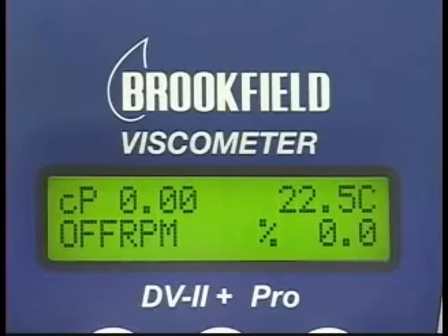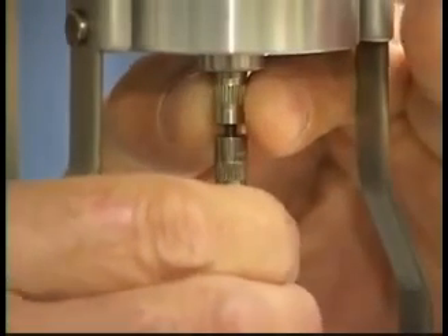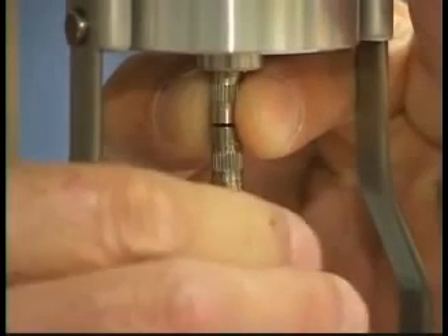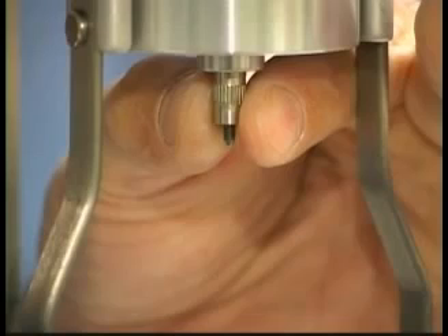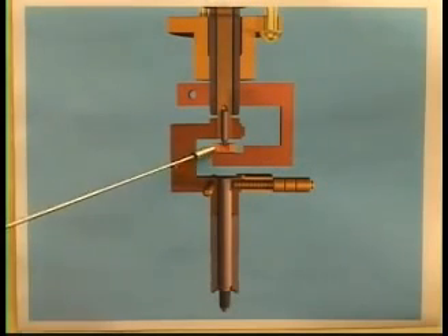With the motor off, attach the spindle by gently lifting up the coupling nut on the viscometer with one hand and screwing the spindle on with the other. Lifting the coupling nut protects the suspension system inside the instrument by raising the pivot point off the jewel bearing.